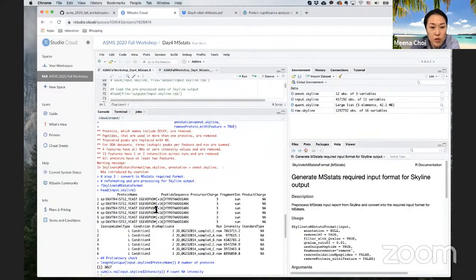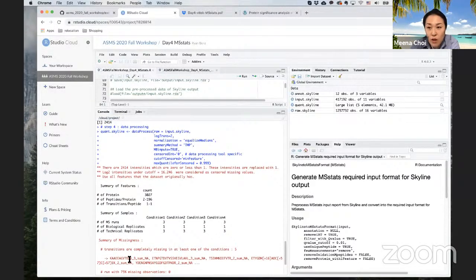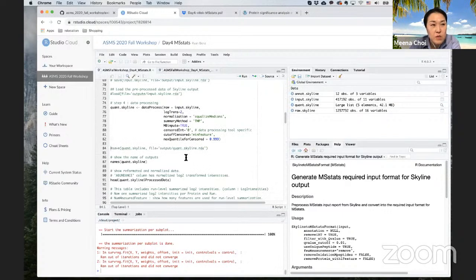For example, here we already have another warning message, so you don't need to worry about it. If you have an error message, it will technically say error and something. So this is the data processing. Then let's see what the data processing output has. Let's just see.